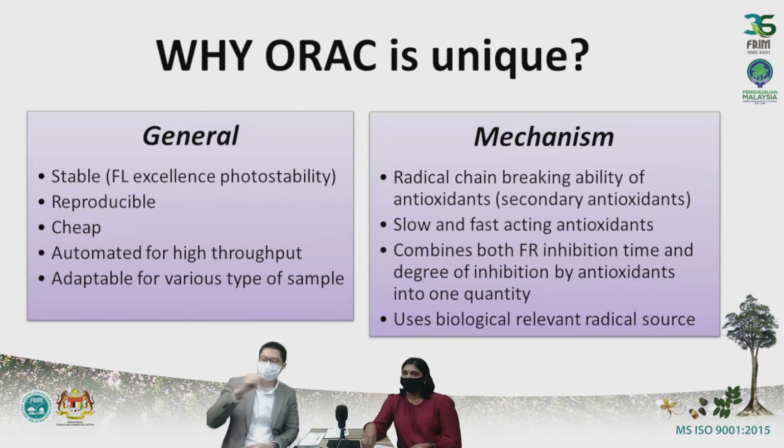Okay, I have a follow-up question here. The interesting part that I caught is the slow and fast acting antioxidants. As far as we know, quite a lot of people know as well that most antioxidant assays are endpoint assays, so you only see one point of data basically. So doing ORAC allows us to have a broader, kinetic view, to see which of your samples act faster and which act slower, for example. Okay, so that's definitely interesting.